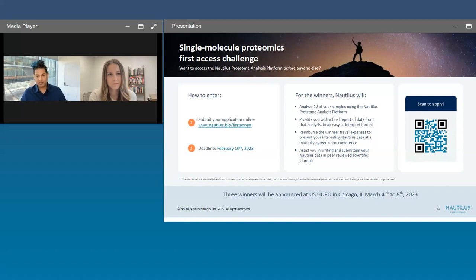One, some false positive rate associated with binding events that are spurious. So you have the likelihood of false positive binding events. You have, given a set of binding events, how close is the next most probable protein? Now, in general, as you start to get a larger number of binding events, the next closest protein tends to be quite far away. But one can ask the question, if I had one less binding event or two less binding events, am I still confident that it is this particular protein? You can also shuffle around the binding events and examine how that might change what your potential protein is. And so in the same way that we can do target decoy in mass spectrometry, we also can do a similar target decoy approach with this method.